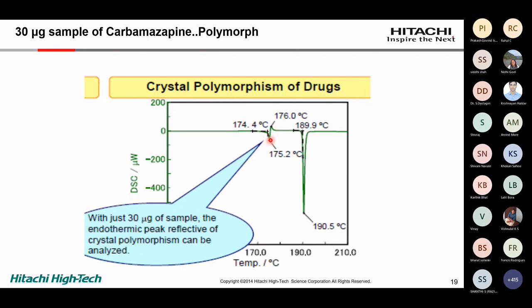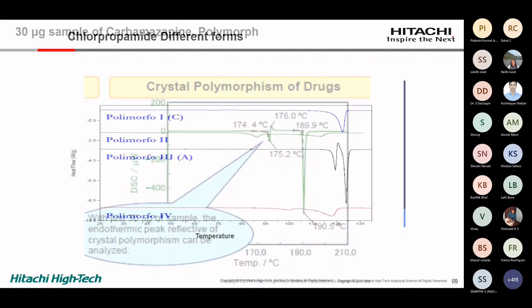And during the melting, the compound immediately crystallizes into another form. On further heating, you can see the second form, which crystallized during the first melting, is melting. So this is how polymorphism is expressed in the pharmaceutical environment, or for people working in dyes and so on. There also we understand polymorphism is experienced.